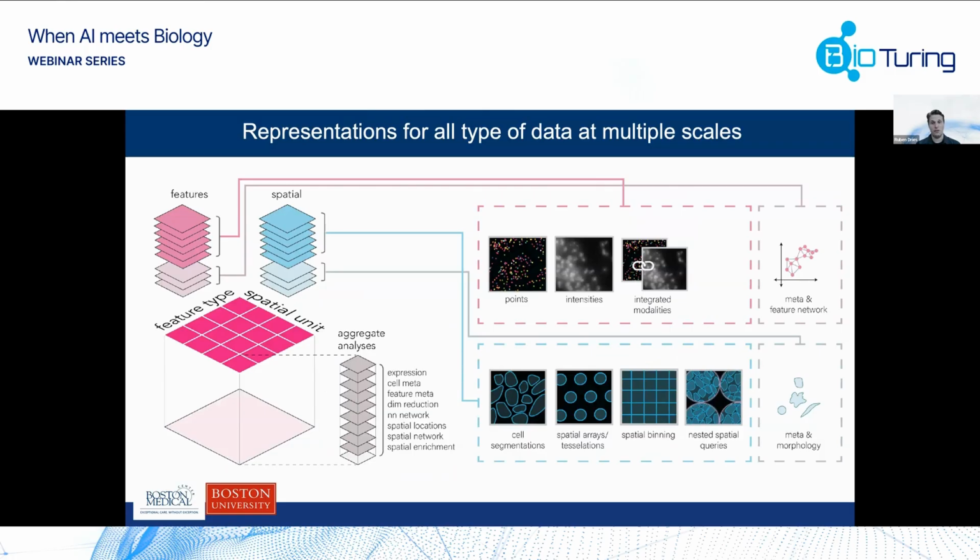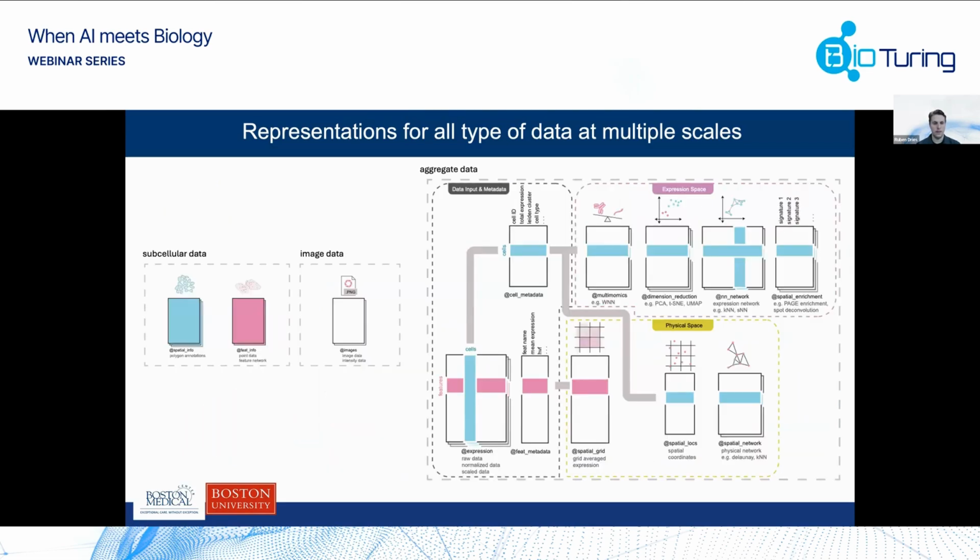And then you can start aggregating it, and you can merge all of that data together in any type of flexible way that you prefer. I will show some of it, how it operates, with some examples in the next couple of slides. A little bit more on the detail level, for some of you that might be interested, this is a little bit how we organize all the data. So we do keep the subcellular data, image data.